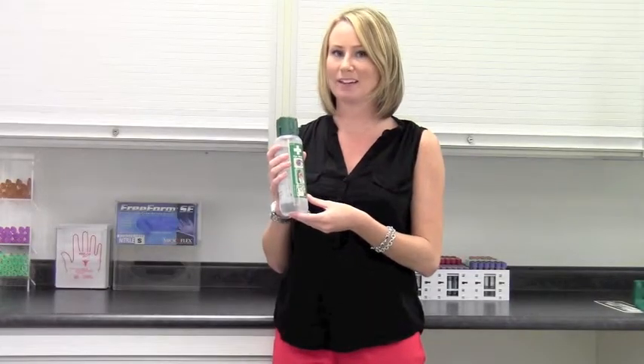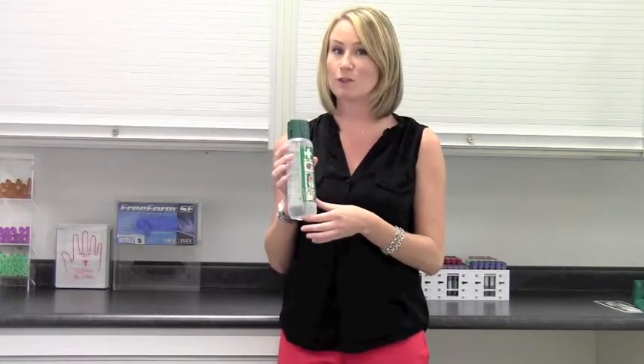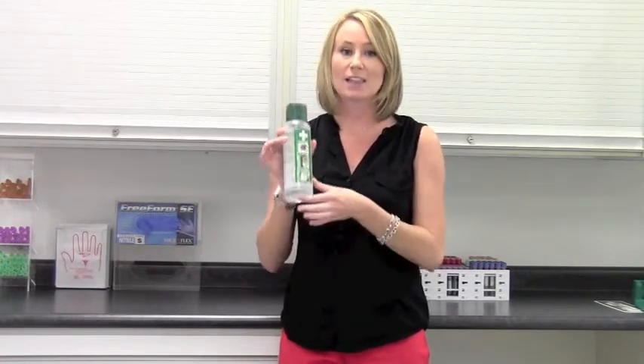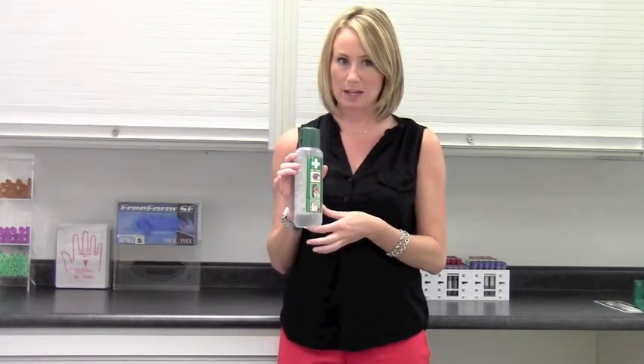Hi, it's Kathleen from Pneumatic Medical, and this is the Cedaroth Eyewash. Because it's vital to start flushing the eye within the first few seconds following an accident, the Cedaroth Eyewash should be your first response to any eye contamination.